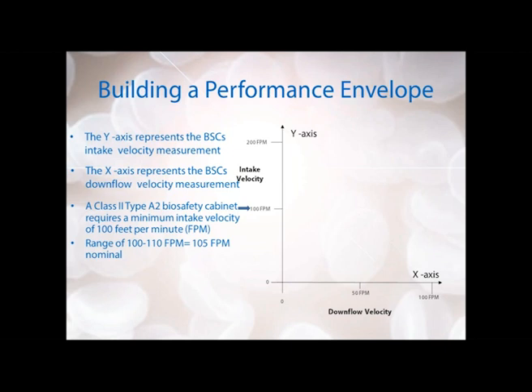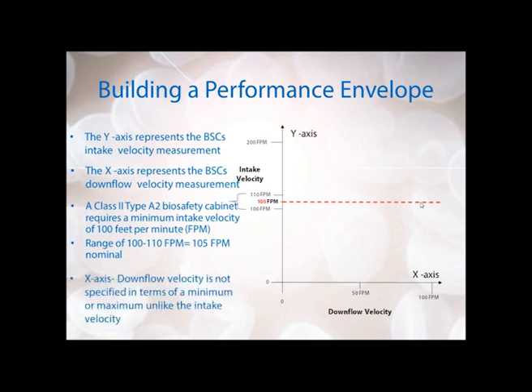That way, if there's any fluctuation in the instrumentation measurement of your inflow intake, it will not ever be below 100 feet per minute. So the acceptable range would be 100 to 110 feet per minute, with 105 feet per minute as your nominal set point. The downflow velocity is not specified in terms of a minimum or maximum like the intake air — this is dependent on whatever the company decides works best for their cabinet. They should let you know what the downflow velocity set point is; for example, we have it set at 50 feet per minute.